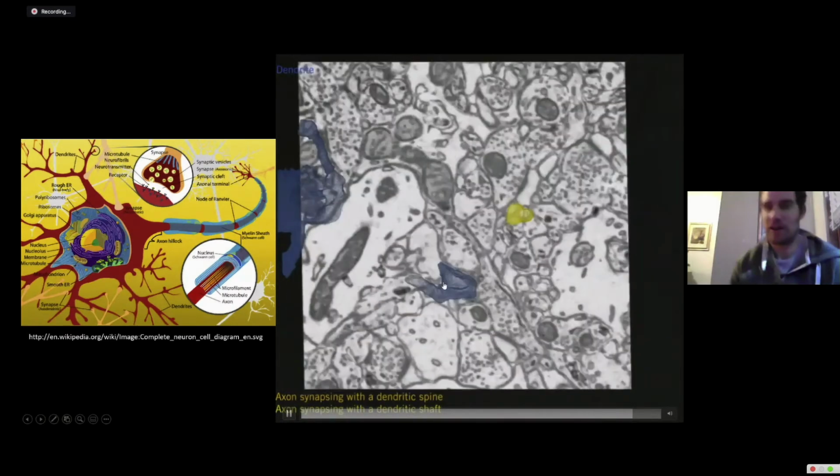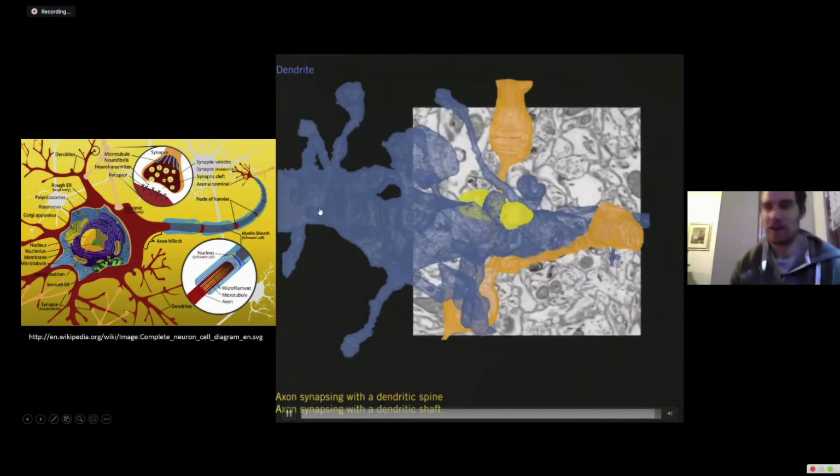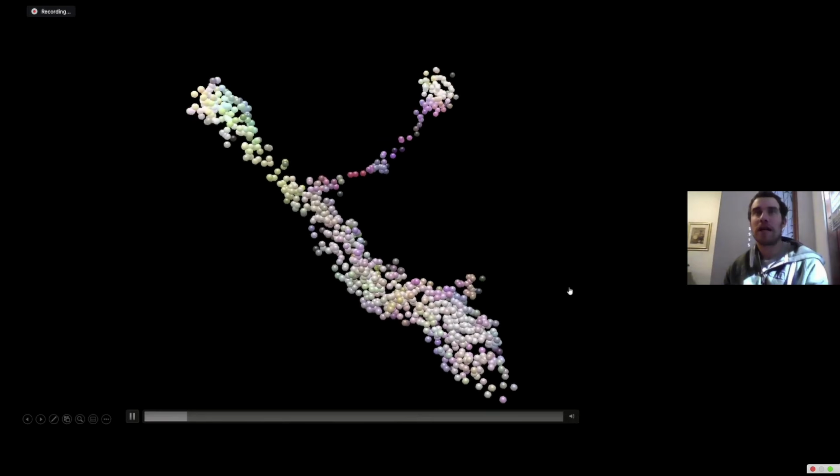This is really one of the most effective ways to study these kinds of phenomena. But it's very time consuming to trace out these processes by hand. So, as Uri hinted at, what Arlo Sheridan is really an expert at in the core is how we take those human training data sets and extend them to massive data sets, for example, an entire fruit fly brain.